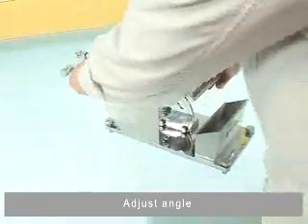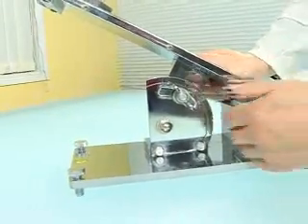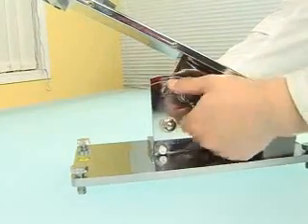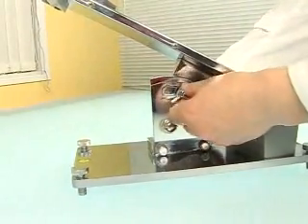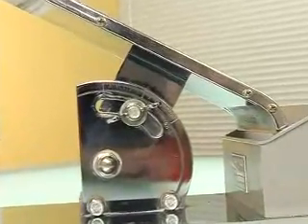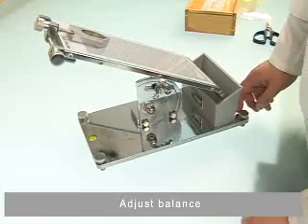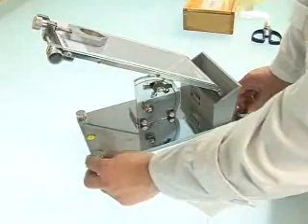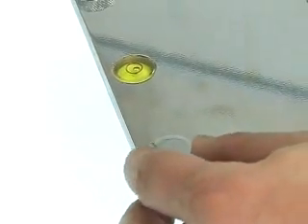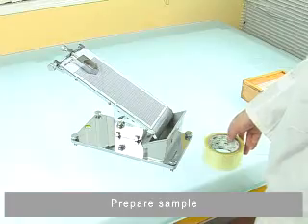Adjust the angle. Adjust the balance. Prepare the sample.